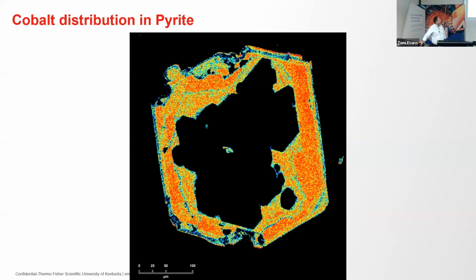We can zoom in. And the next question is, what is the concentration of cobalt in pyrite in particular areas that we can detect? Anyway, we're talking about EDS. EDS is not particularly known for trace element analysis. It's more for minor and major elements. So we checked, and the areas with higher cobalt in this example had around 1.8%. And then we can still identify cobalt and quantify it as low as around 0.3%.